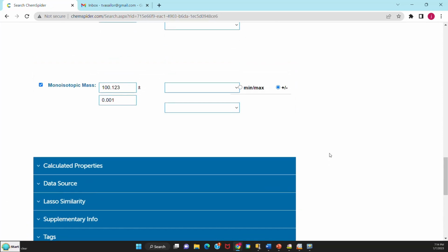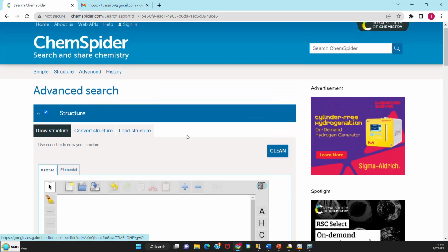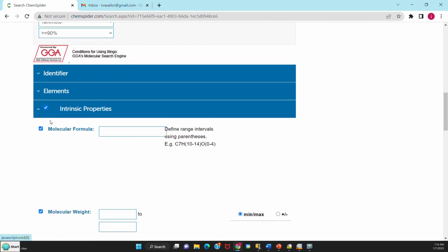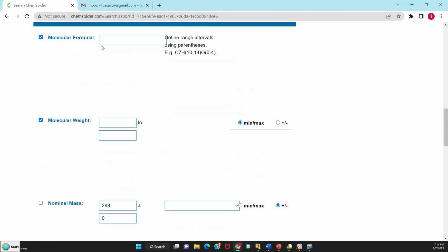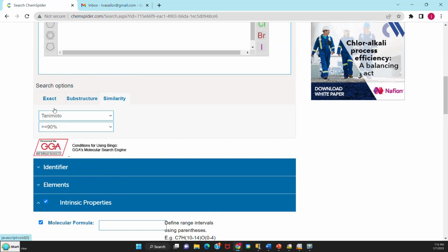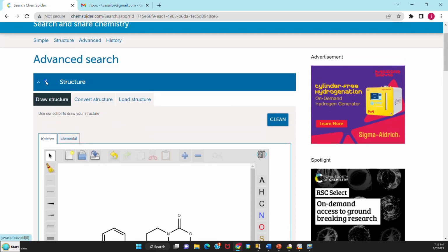The other thing is when you first come into the program, if you have something clicked and you forget about it, like it's going to search structure here, unless I unclick this little arrow here. If that's clicked, it'll search that. And if I have the intrinsic mass, so I'm doing an accurate mass, it will search it also. So it'll search both things because there's two things selected by this little check mark here. So if you don't get any results, or you get nonsensical results, you need to make sure that you have those set to either search or not search.